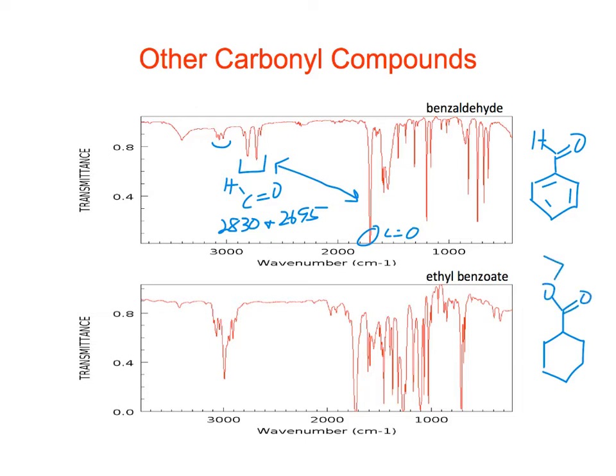So it's an ester. Right, so we see both sp2 and sp3 bonded hydrogens. We have the ester carbonyl, and so for esters, there's 2 carbon-oxygen stretches.